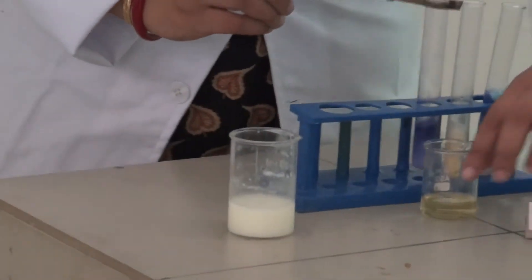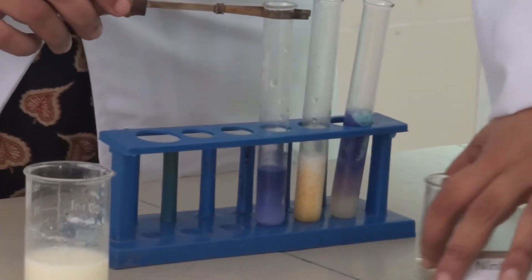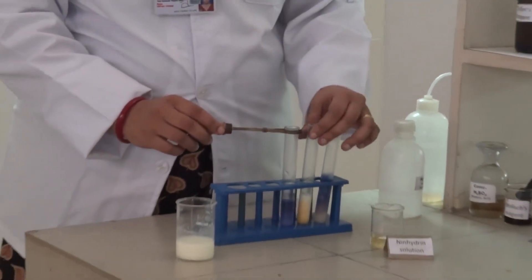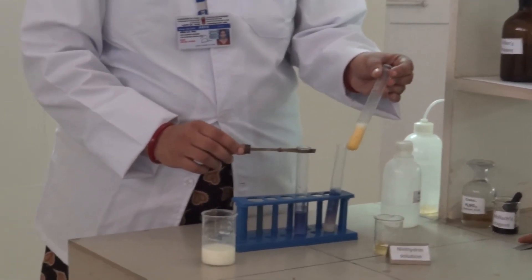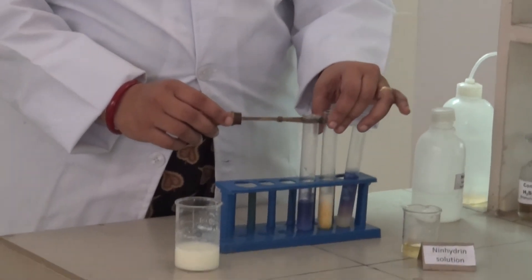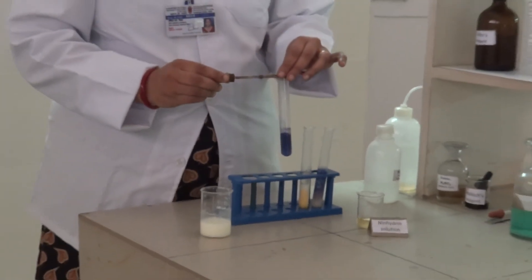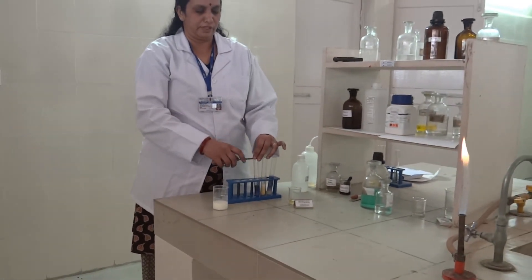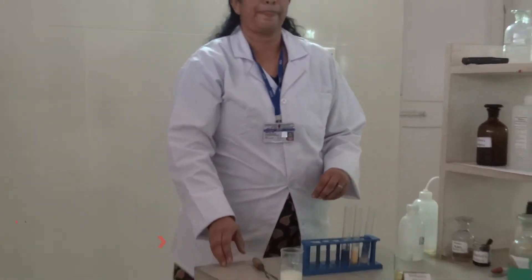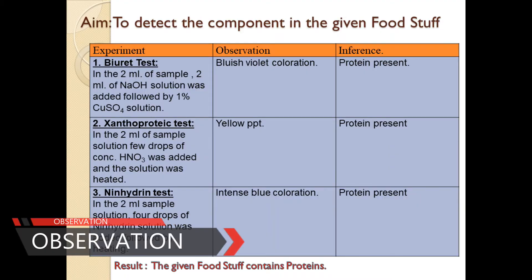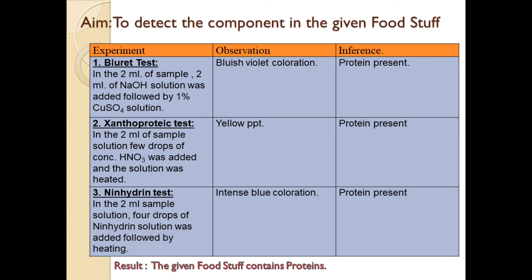We have got all three tests here. The first test, the Biuret test — it's quite violet. The second test is the Xanthoproteic test — turning yellow in colour with concentrated nitric acid. And the third test with ninhydrin — it's turned blue in colour. So these three tests confirm the presence of protein in the foodstuff. Now record these three experiments, their observations and inference in your practical record. Don't forget to write the aim, the experiment, observation, inference and the result.